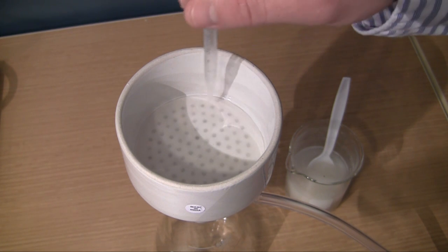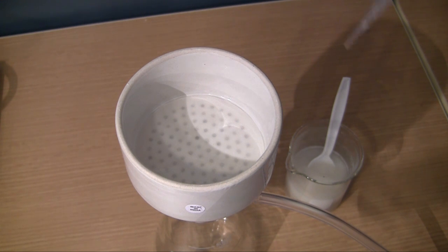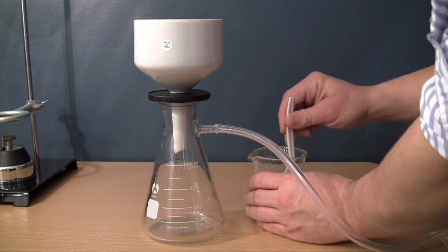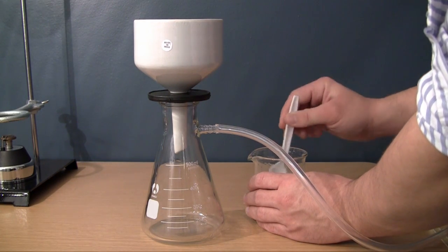So now, as you can see, our paper makes a really good seal and none of our mixture is going to go between the sides of the paper in the funnel. So now, of course, the only thing left to do is to go ahead and filter our mixture.